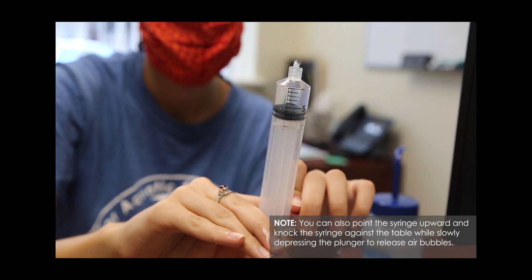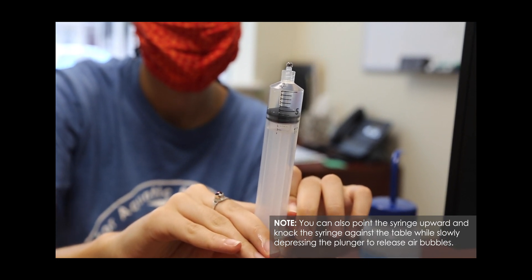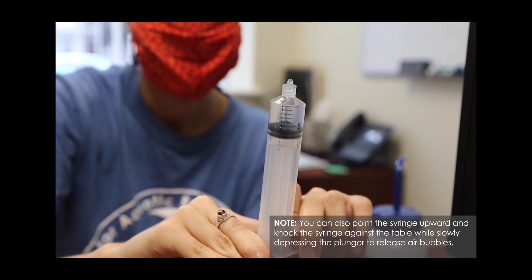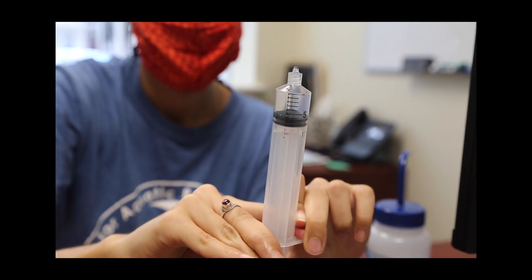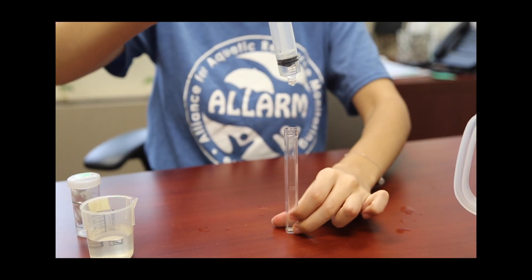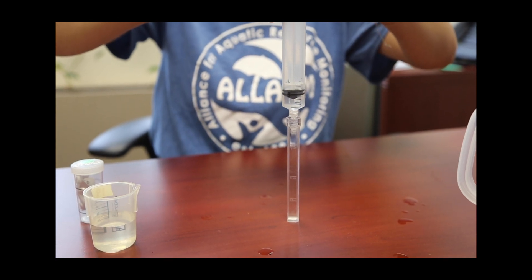Do this over your liquid waste container. Do not return excess water into the original sample collection bottle to avoid contamination of any kind. You can now transfer the water from your syringe into your test tube.